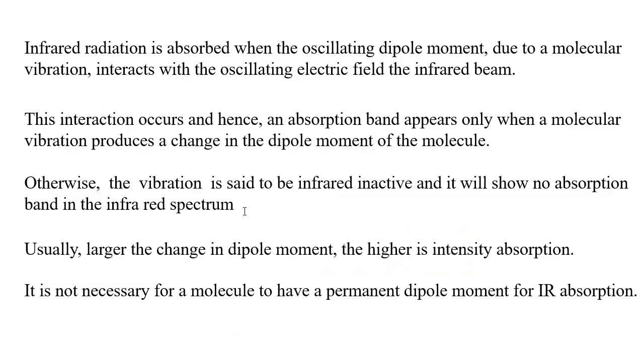You know what happens when infrared radiation is absorbed by a molecule. See, infrared radiation is absorbed when the oscillating dipole moment due to a molecular vibration interacts with the oscillating electric field of the infrared beam.